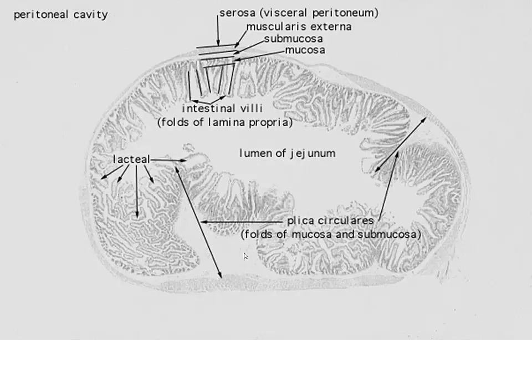But the biggest thing that tells us we're looking at jejunum is the absence of any glands. So no Brunner's glands. We know we're not in duodenum. And we know we're not in ileum because we don't see any secondary lymphoid nodules, those Peyer's patches. So it's the absence of material here that clues us in that we know we're intestinal tract, but we are in jejunum and not any of the other two because we don't see those distinguishing features of either duodenum or ileum.